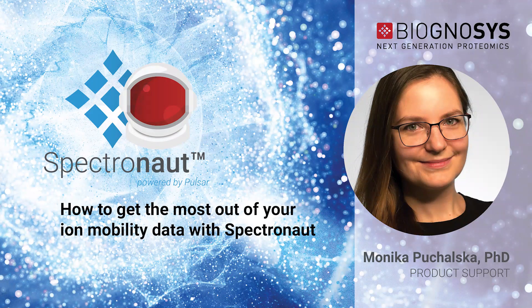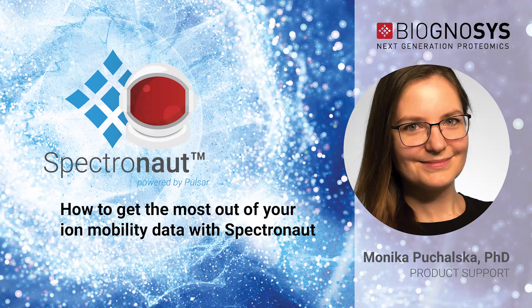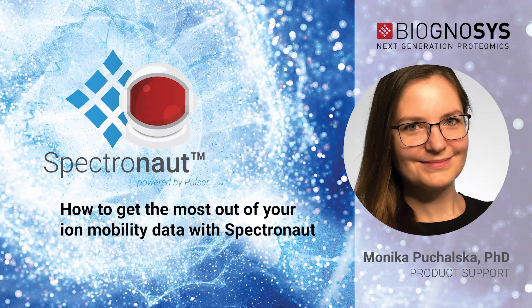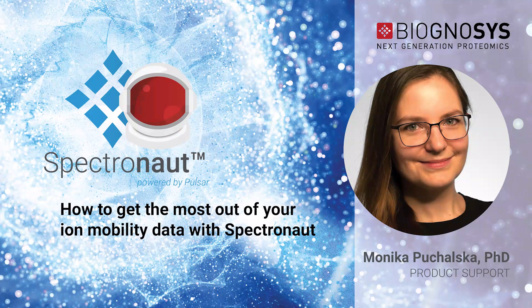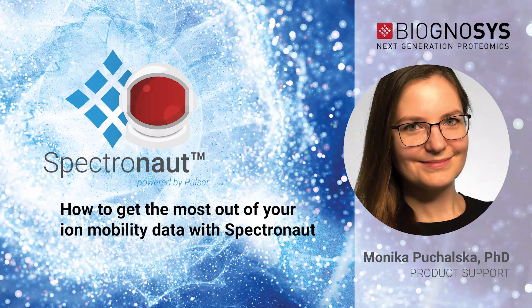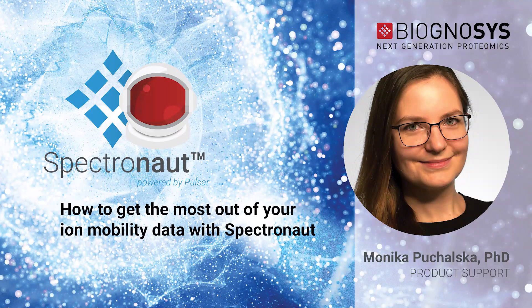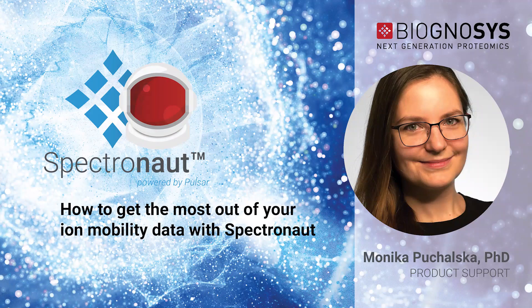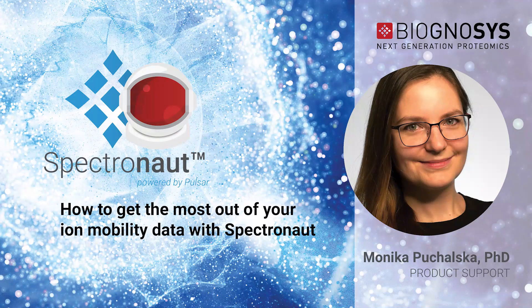Firstly, let me explain why we would like to focus on ion mobility. In classical proteomics, we deal with three-dimensional data: mass-to-charge ratio, retention time, and peak intensity.